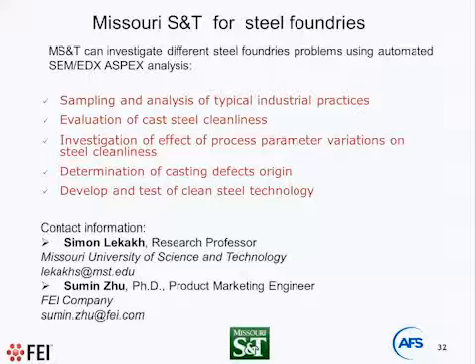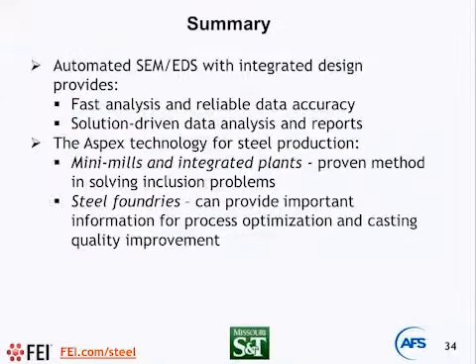Sumin? Okay, so I think the question is about the matrix contribution and its impact on the inclusion composition. I think that's a very good question because the matrix does impact the composition of inclusions. Right now, the technology we developed is to increase the X-ray takeoff angle.